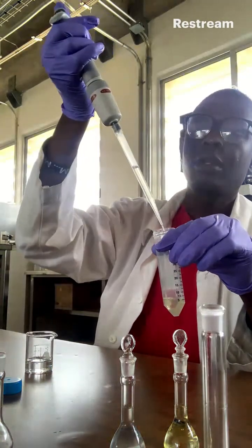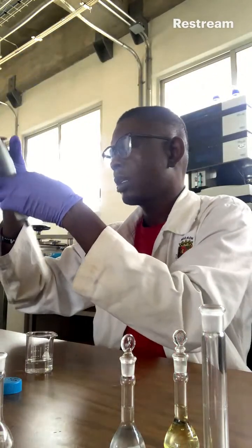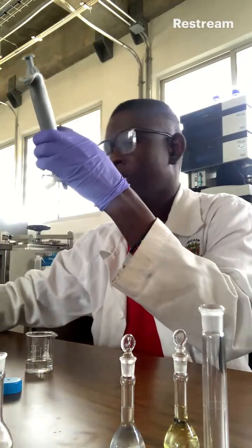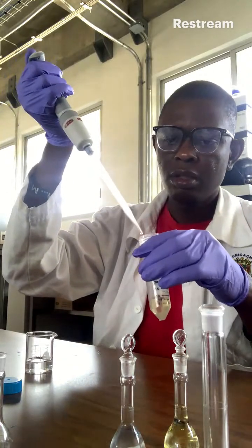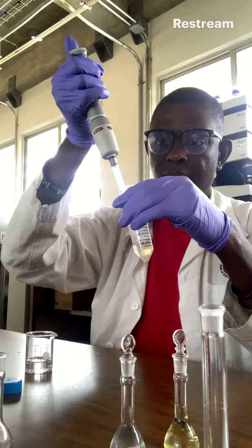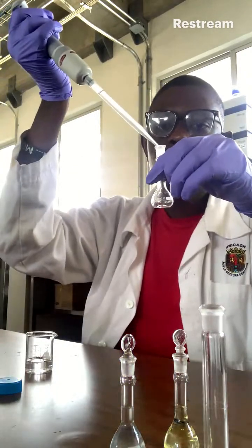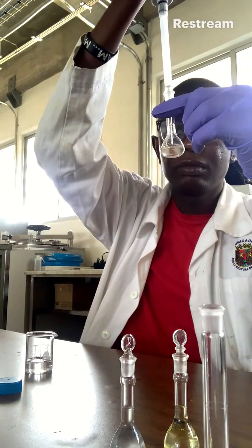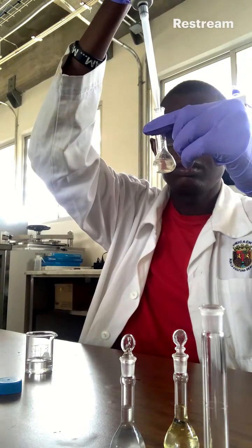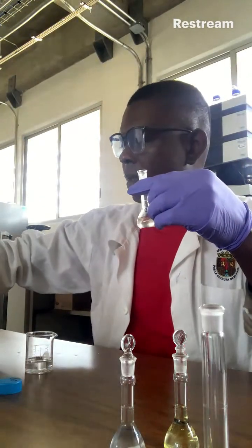There is a problem with this valve, I think. Okay, all right. So I'll have to empty this into this container too. I'll take it back.